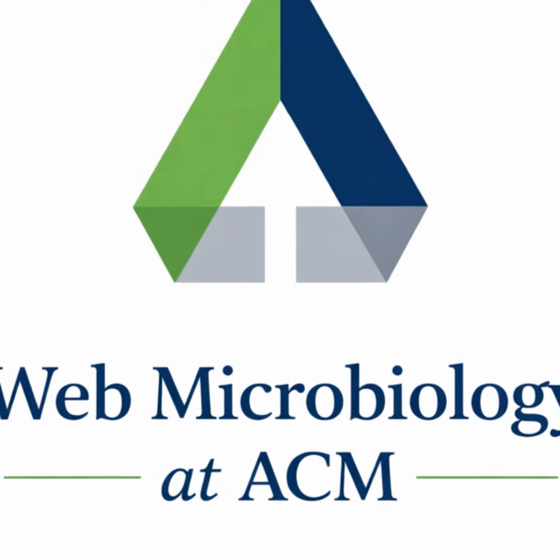Now that's all out of the way, the Unknown ID Dry Lab has a couple different parts. The first is designed to help you get oriented to a dichotomous key. This is just a fancy name for a workflow that uses yes or no answers to narrow down possibilities. You might not understand what every term or word means when you look at the dichotomous keys I provided, but you should be able to follow the logic, follow the arrows and the charts. If that's difficult, please take some time to learn how to read a flowchart.